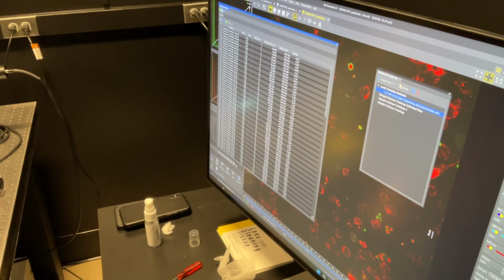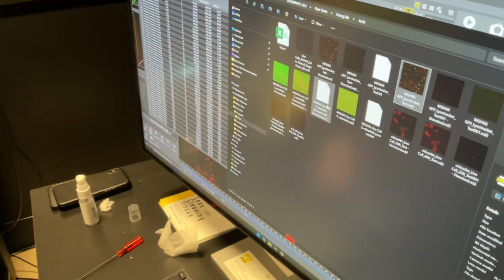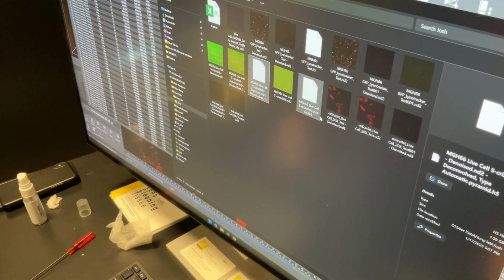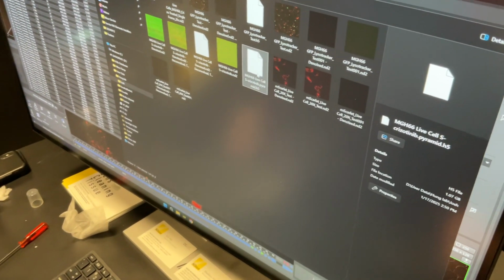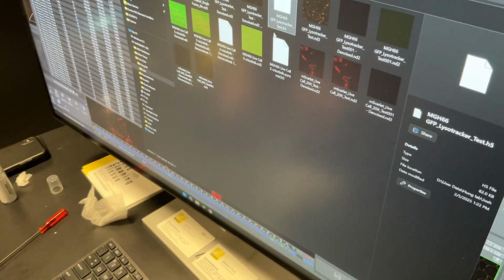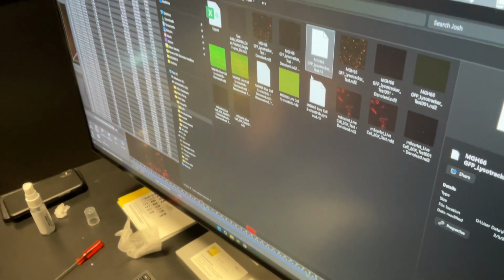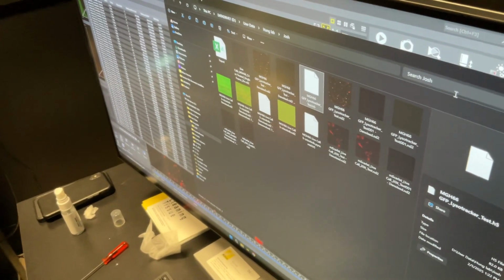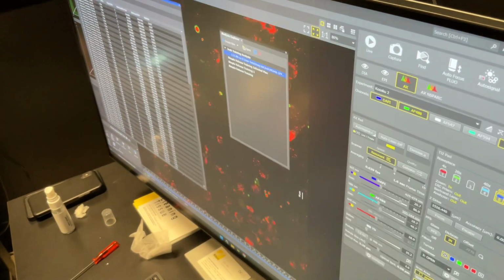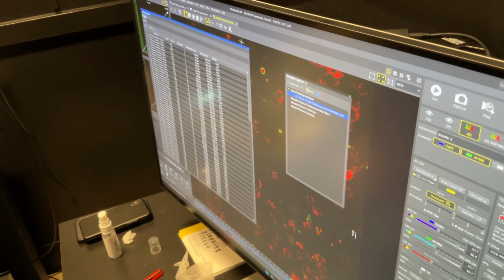Perfect. Because you'll see wherever this was saved, there are now going to be some .h5 files. I think that's the data in the format that GA3 uses. Okay. They never explained that to me. That's fine. Yeah. But those will exist. That's your data. Don't delete it, unless you want to run your experiment, your analysis again.